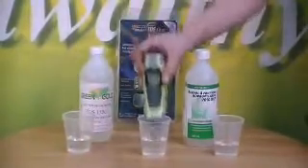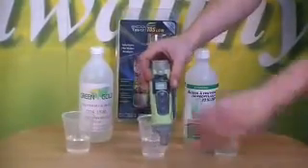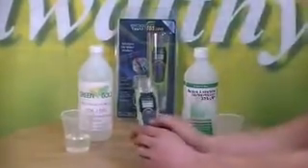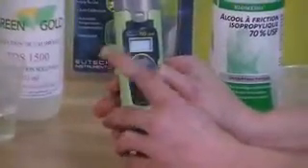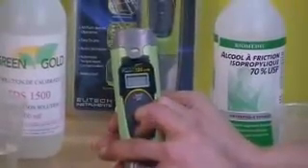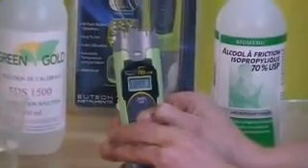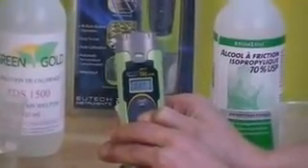Afterwards you're going to have to change your factor number in your pen. The way to do that is hold your calibration button, which is the middle button here. You hold it while the pen is off, then press your on button once. You keep holding your cal button after you press the on button, wait about 2 seconds, then let go.